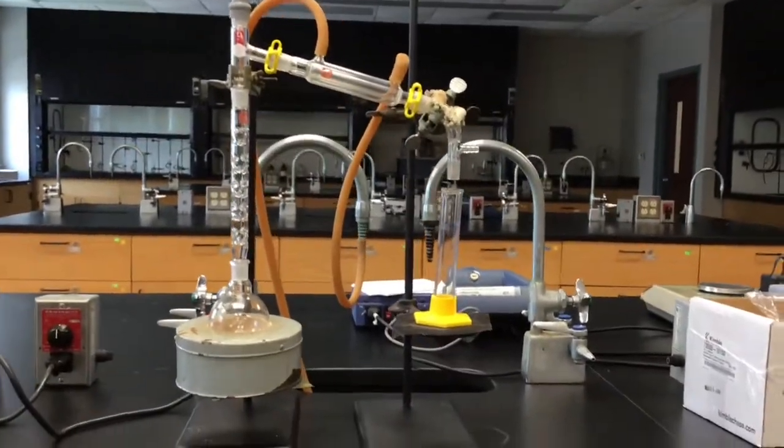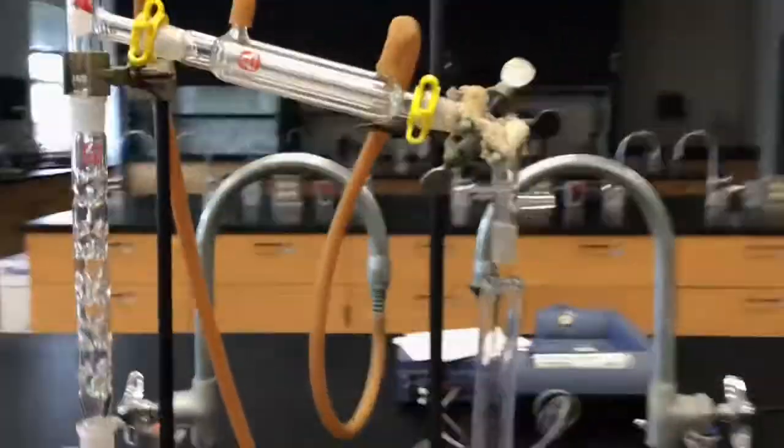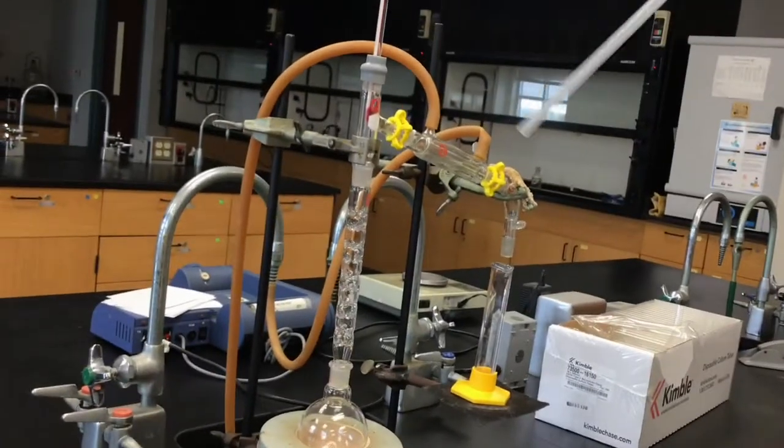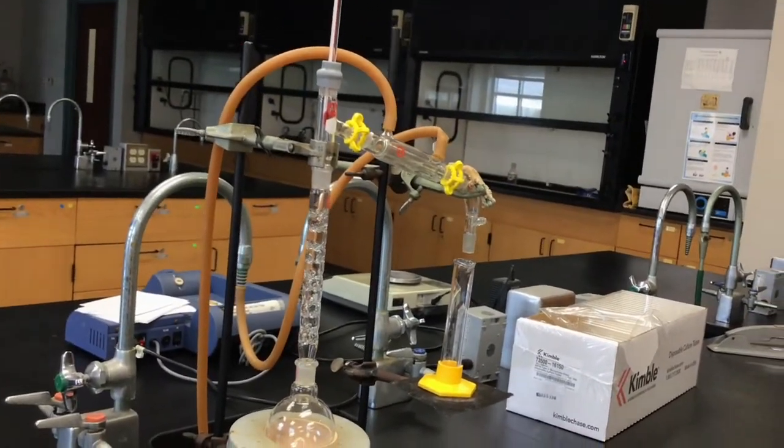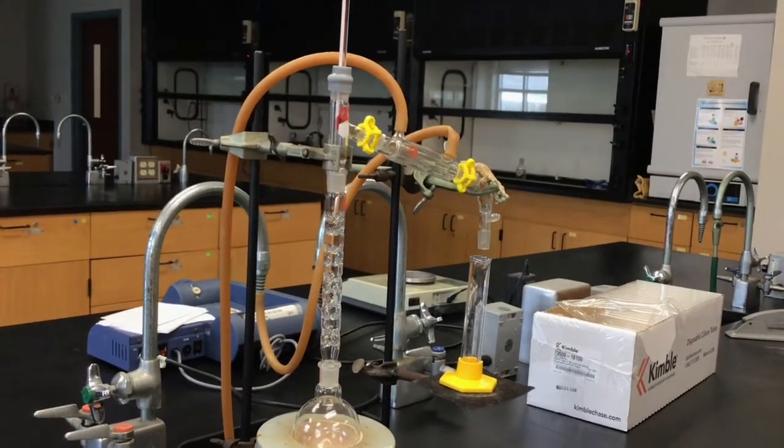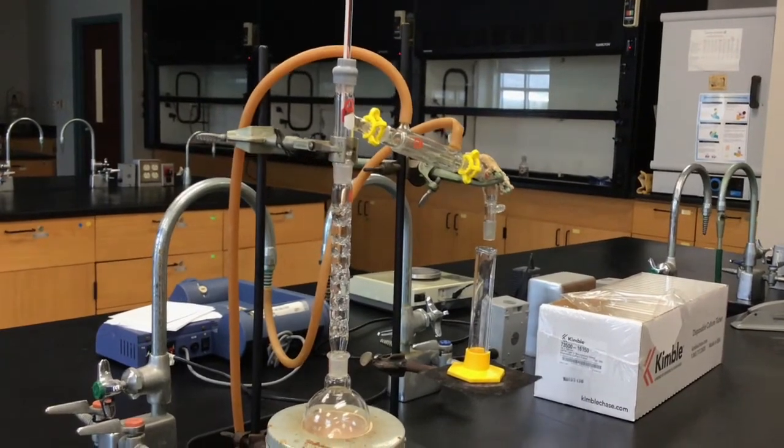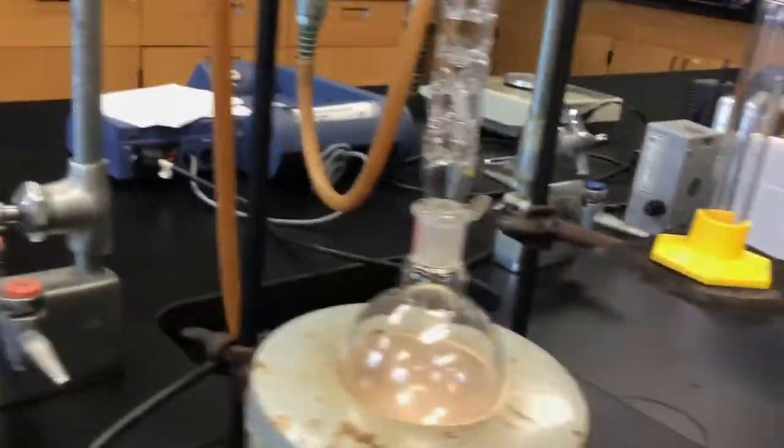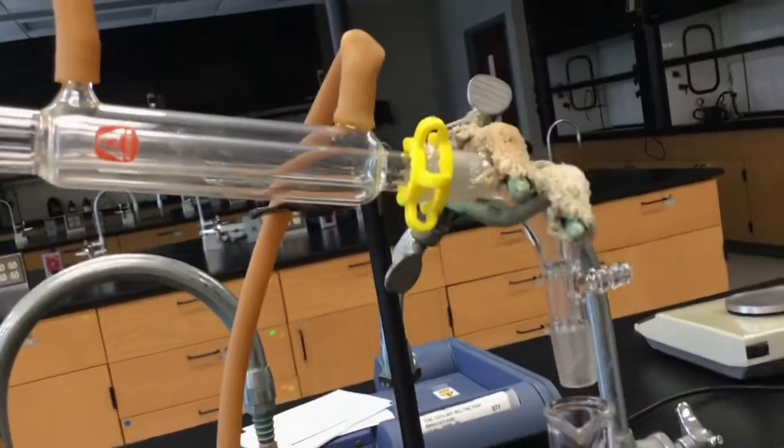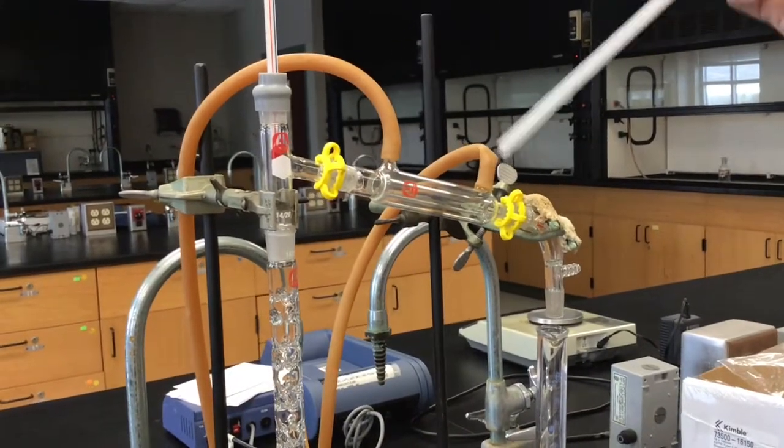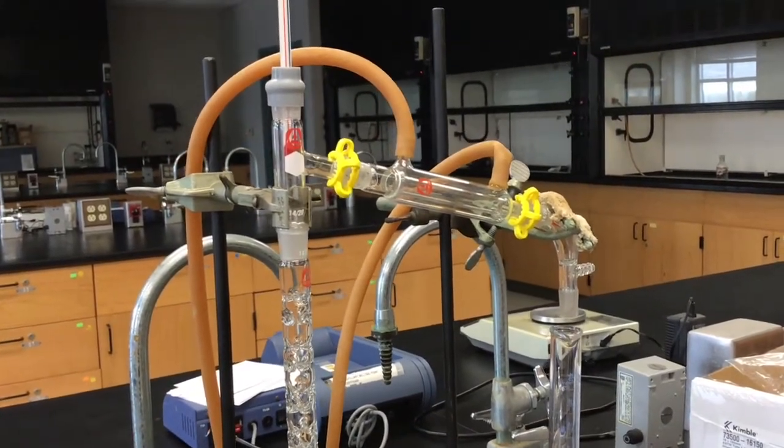The next part up here is the condensing column on the side. This is also important when you're performing your distillation. The principle of this is you're flushing cold water through the inside of the condensing column to turn the vapor back into a liquid and you need to make sure that you have this entire inside filled with running water. You don't need to have Niagara Falls running through it, you just need a little bit to keep it cool. So you have to make sure that, this is very important, you need to make the water come up through the bottom and then out through the top. If you send it through the top and through the bottom, you're going to get just a trickle of water on the underside which won't cool anything off. If you force it from the bottom up, it will encase the column and cause everything to be fully encapsulated in the water and it should condense very well.